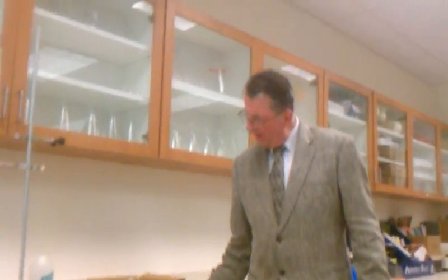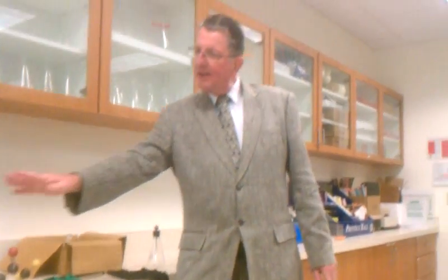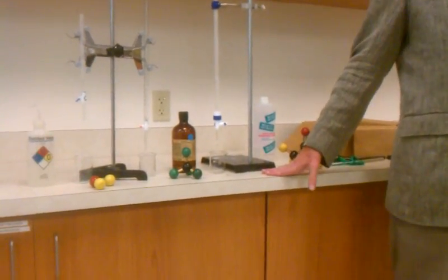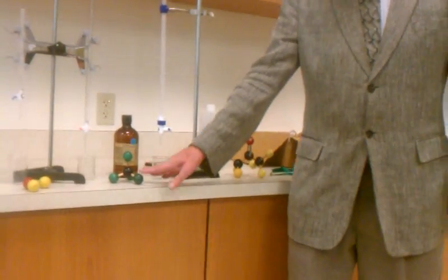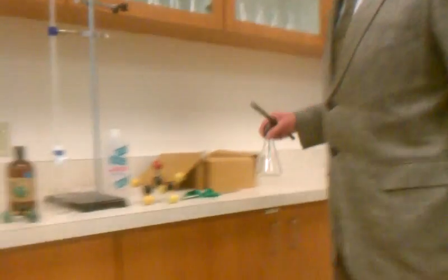Okay, so here's what I'm going to do. I don't know if I'll use both. Maybe I'll use both rods to show for water, but I don't have to use it for all. Water is the most polar. Then acetone is polar, but not as polar as water. And then carbon tetrachloride, I said, because of its shape, is a totally nonpolar compound. So watch this. I'm going to prove I have a charge in each case with my electroscope.